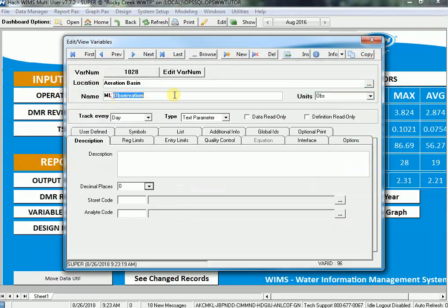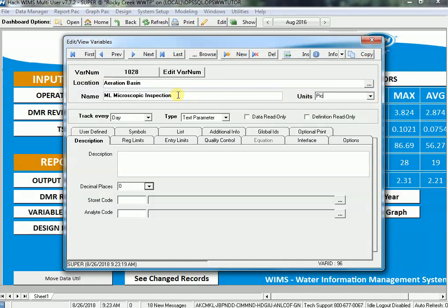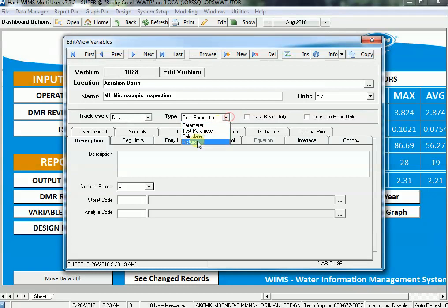I got a new variable. I'm going to name it Microscopic Inspection and set the units to Pick. It says I'm going to track it every day. When I go to Picture, notice that this is grayed out.